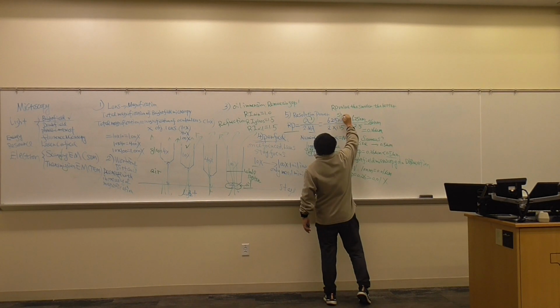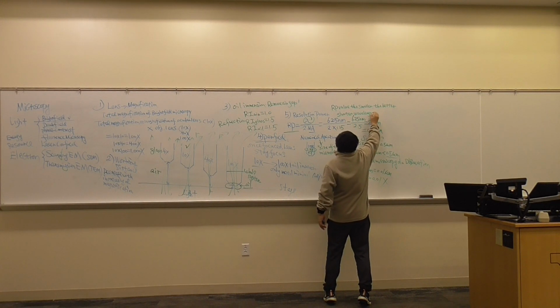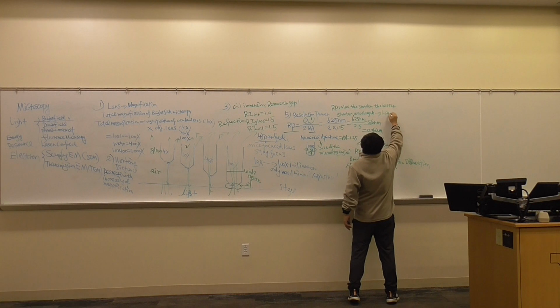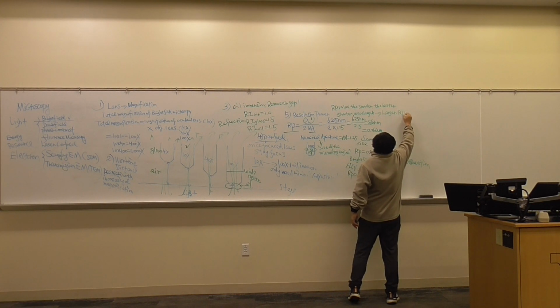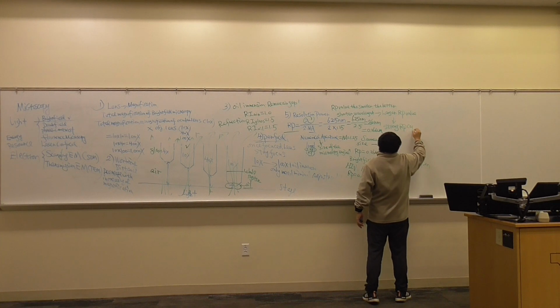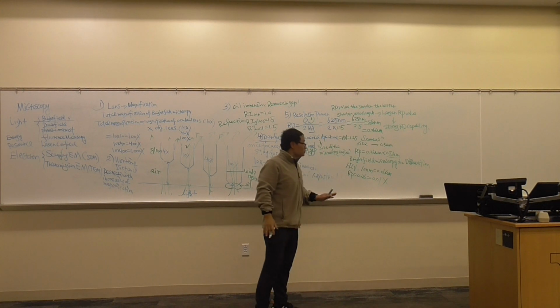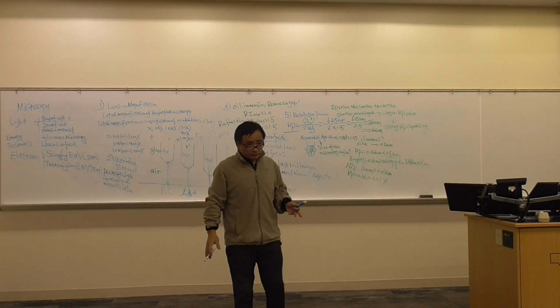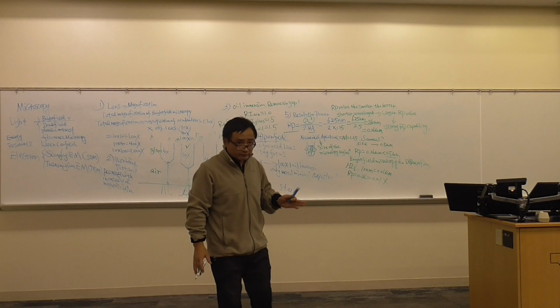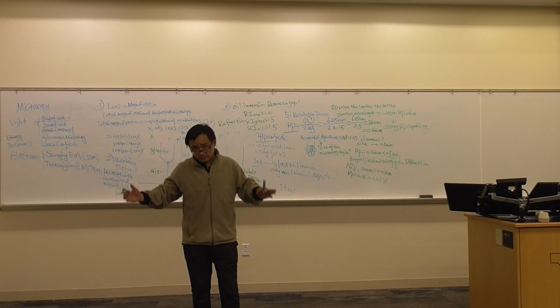Therefore, it comes out that a shorter wavelength will cause a smaller resolution power value, which means a very strong resolution power capability. That means if you use a bright field microscope with a shorter wavelength, it has a very strong resolution power, and you could see the microorganism much more clearly.